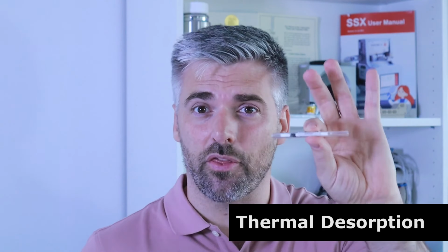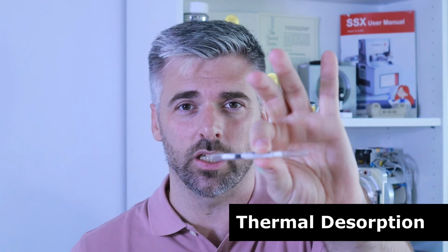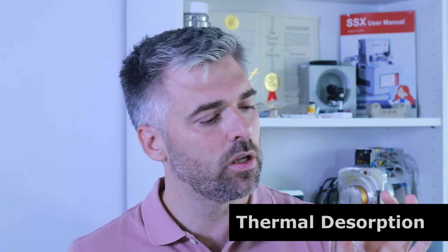Here's how it works. This is a thermal desorption tube. It has a trapping material inside. You blow inside the tube like that. This tube traps the volatile compounds from your breath. In the lab, the tube is heated to release those compounds and analyze them.